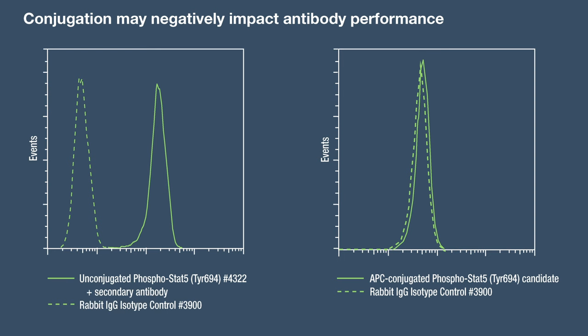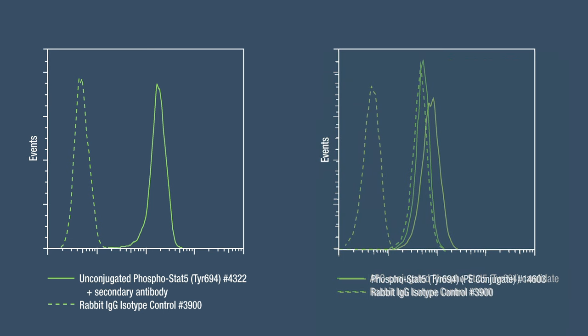The example on the right shows an antibody conjugated with APC that failed to perform in flow cytometry, compared to the unconjugated phospho-Stat5 antibody detected with a secondary in the left panel. This particular APC-conjugated antibody failed our validation testing and was not released as a product. Fortunately, by switching to a different fluorophore, phycoerythrin, we were able to produce a phospho-Stat5 antibody conjugate that passed our validation testing.